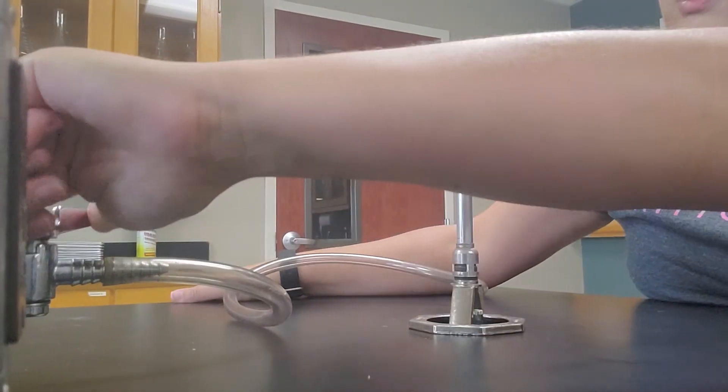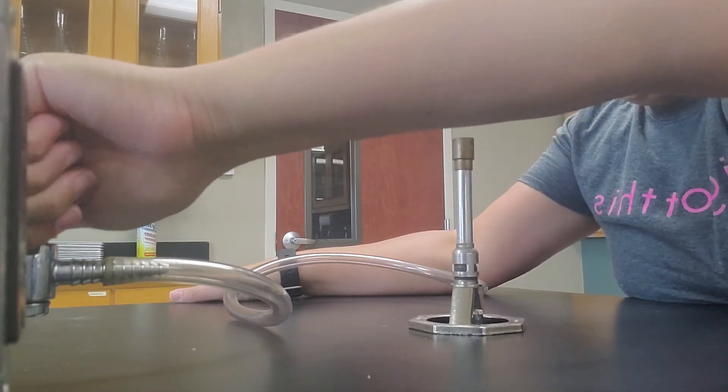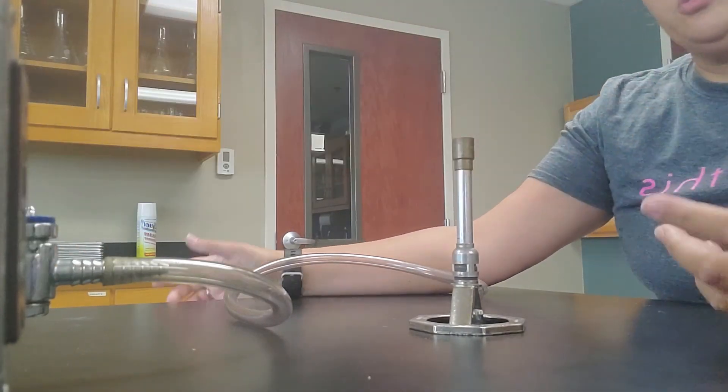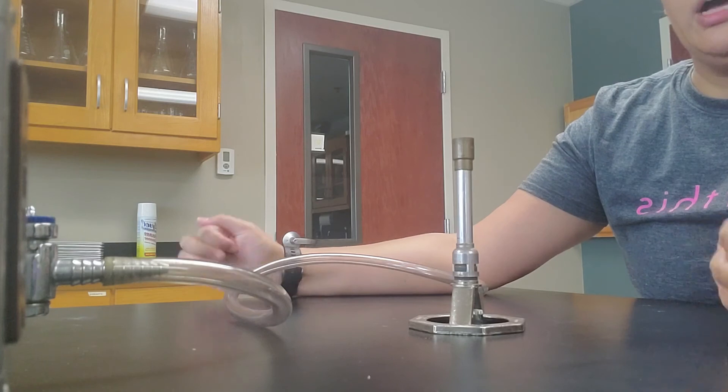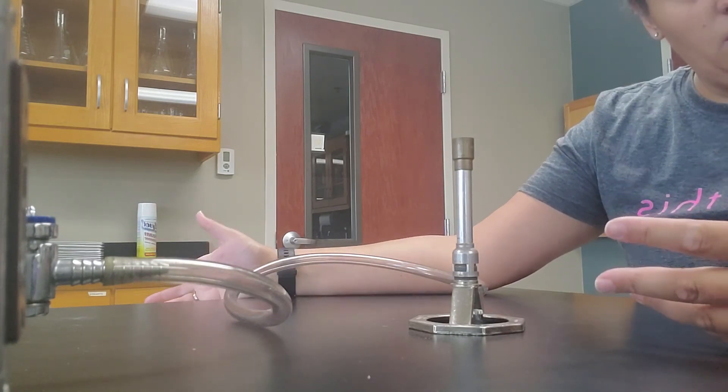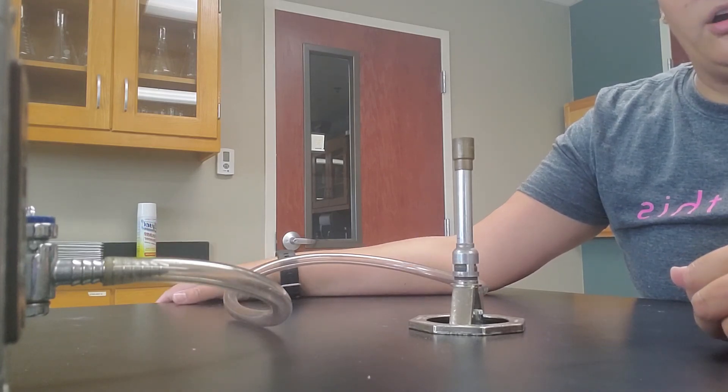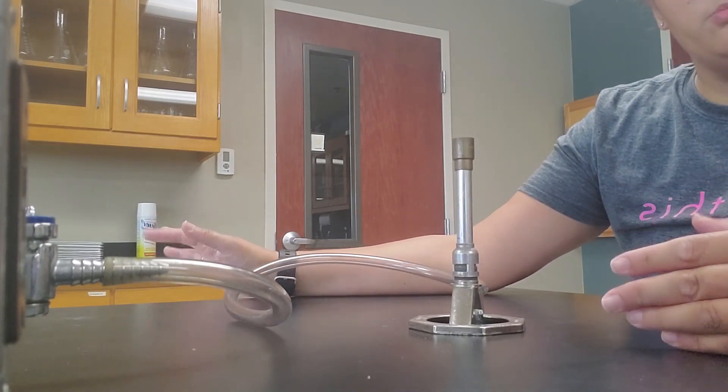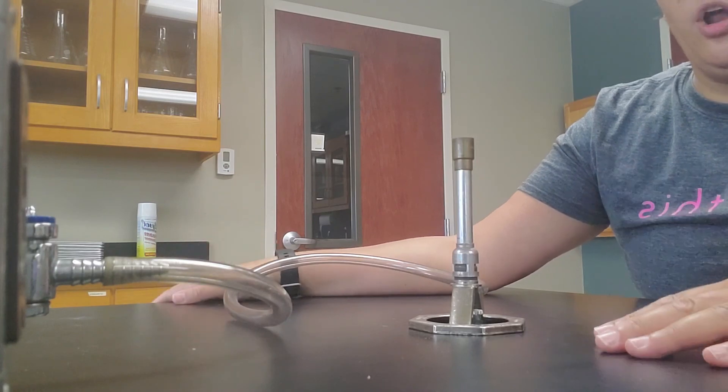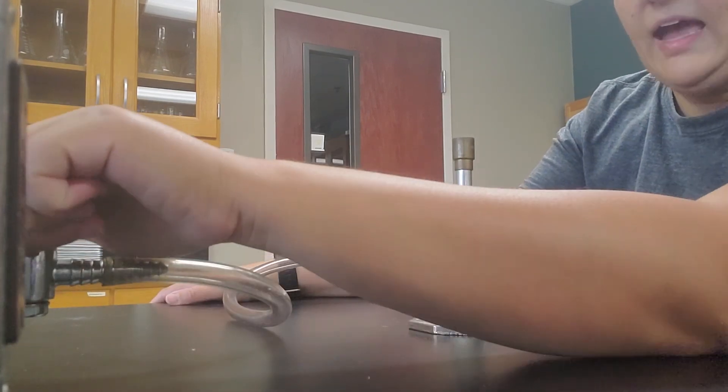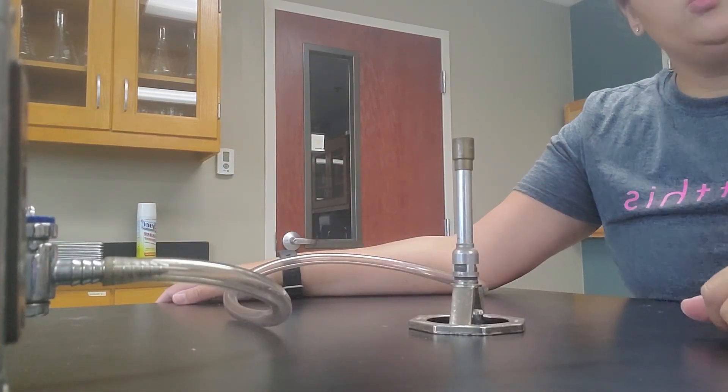When you're done with the Bunsen burner, turn off the gas. That's always kind of a big deal. Turn that off. Whenever you're using these, you'll notice my hair is not in my way. I've put it up so that way I don't accidentally catch my hair on fire. I've had students almost do that before. So just kind of be aware of the Bunsen burner. When you're not using the Bunsen burner, if you're done with it, turn it off. It's just a good practice. Make sure that gas is turned off. And then you are set to go.